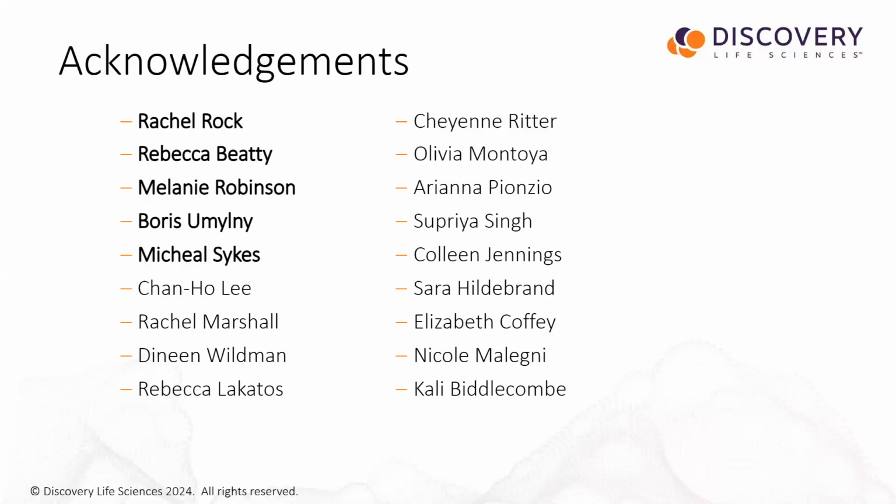I think we have settled on our plan for the incorporation of the Covaris technology across the board, from both isolation and the library prep.